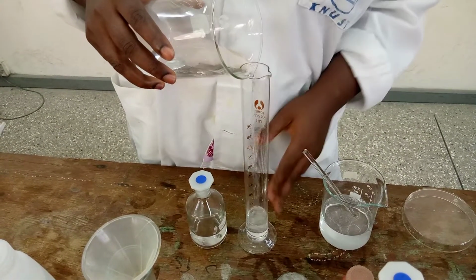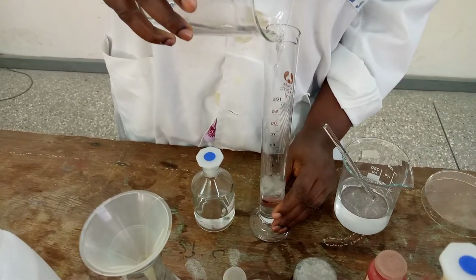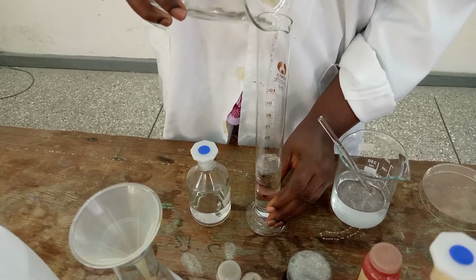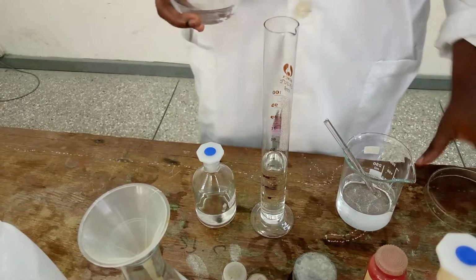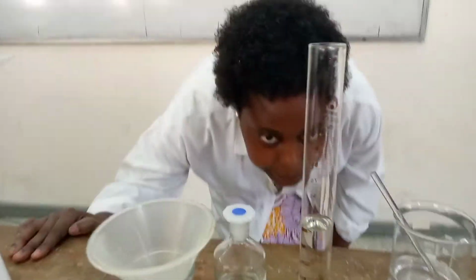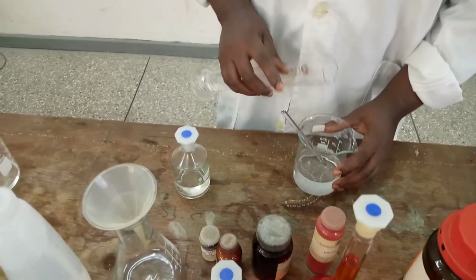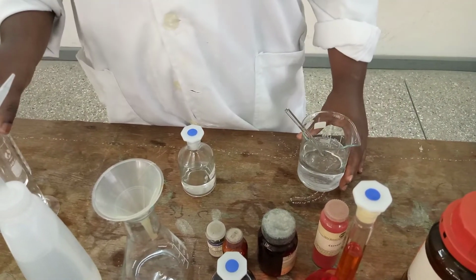As I'm pouring, I'm checking if it's on 50. Cover it quickly, then check. Yes, it's on 50. So I'll add it nicely and stir.